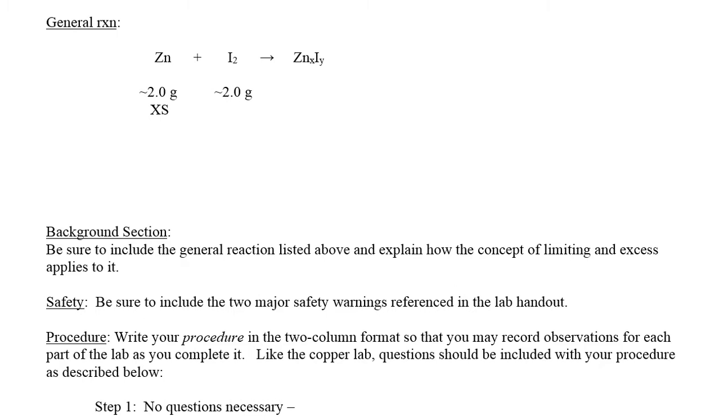Like the copper lab also, there are some questions that should be included with your procedure. However, some of them I think are really unnecessary to actually write out in your procedure. They're more just helpful steps to determine how to analyze the data. So this is what I would recommend.